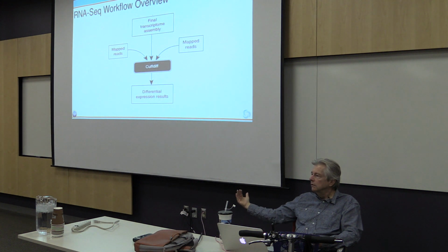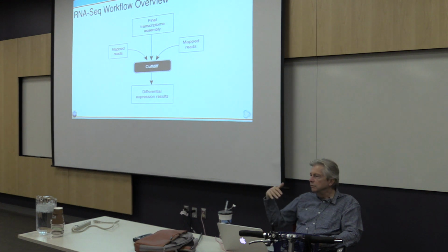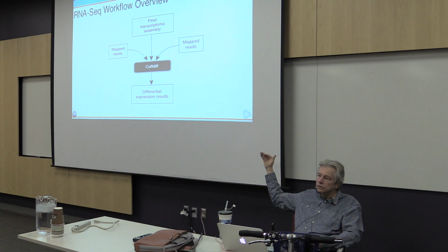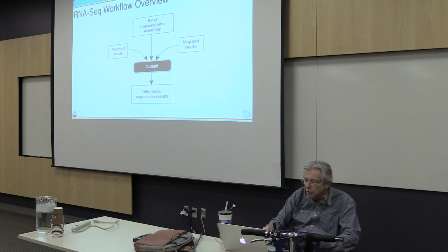And that's handy. If they don't really match up, then they'll just have an assembly name, in a sense a random name. Nothing that makes sense, but it's a name to mark that this is a new transcript, and it's up to you at some point if you need to identify what it is. It may be tied to a specific gene, but it could still be a new transcript, a new isoform.